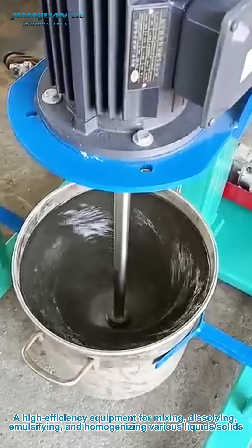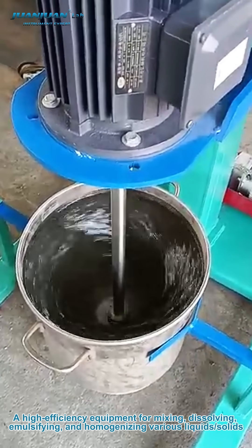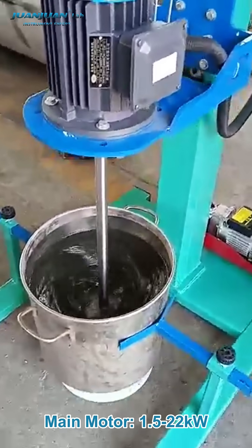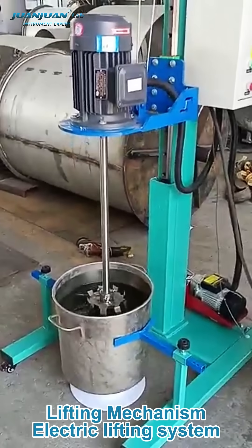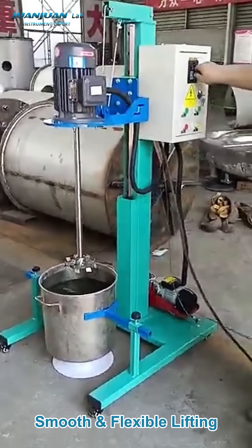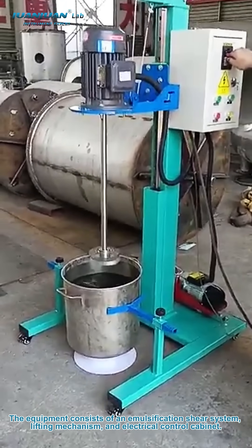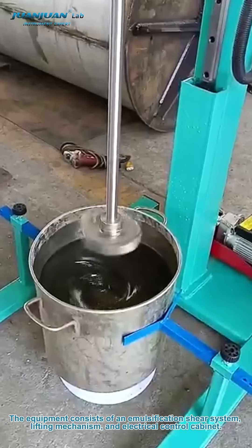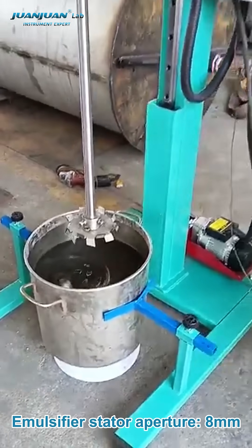A high-efficiency equipment for mixing, dissolving, emulsifying, and homogenizing various liquids and solids. Main motor power range: 1.5 to 22 kilowatts. The electric lifting system provides smooth and flexible lifting. The equipment consists of an emulsification shear system, lifting mechanism, and electrical control cabinet. Emulsifier aperture: 8 millimeters.